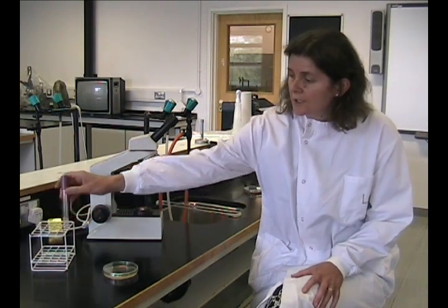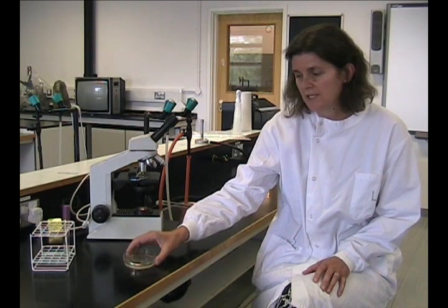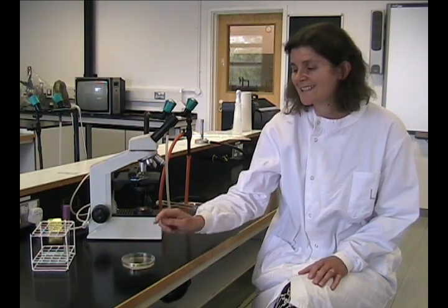Bacteria can grow in a liquid culture or they can also grow on solid media. The easiest way to isolate a pure culture is to streak them out onto the surface of the solid media, diluting out the bacteria until you get single cells on the surface of the agar. These single cells will then each grow up when incubated to produce an isolated colony. These single isolated colonies are all derived from one cell. You therefore know that you're working with a clone or a pure culture of bacteria.